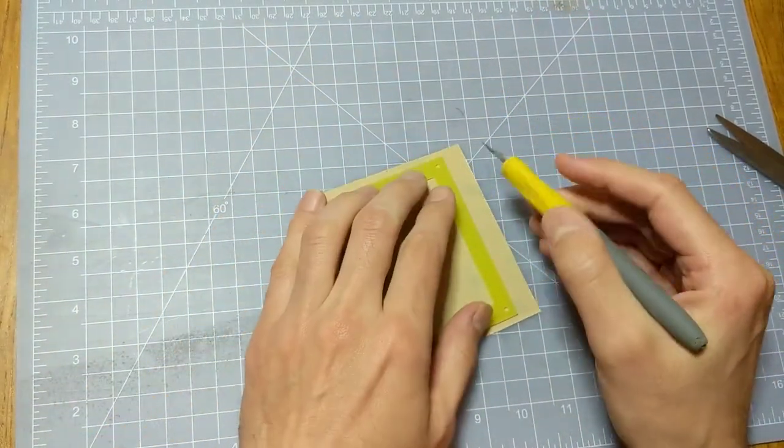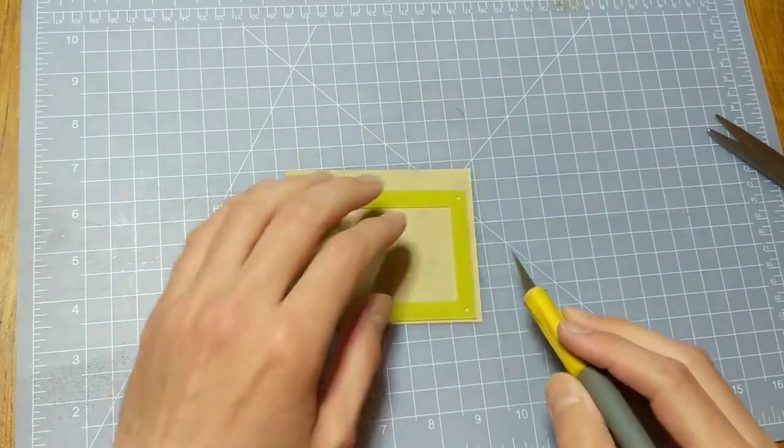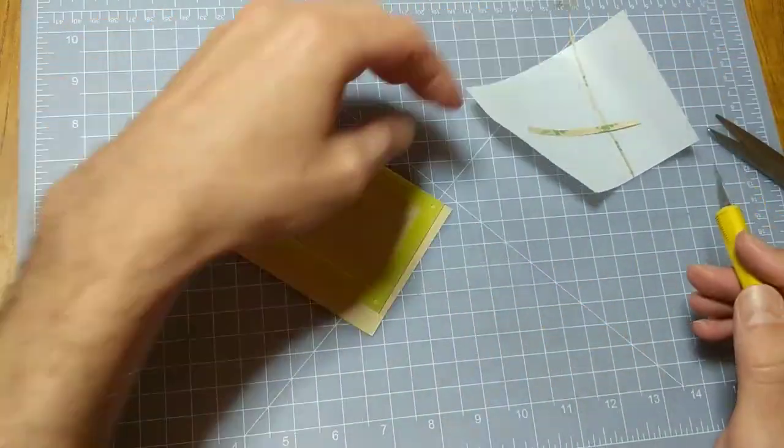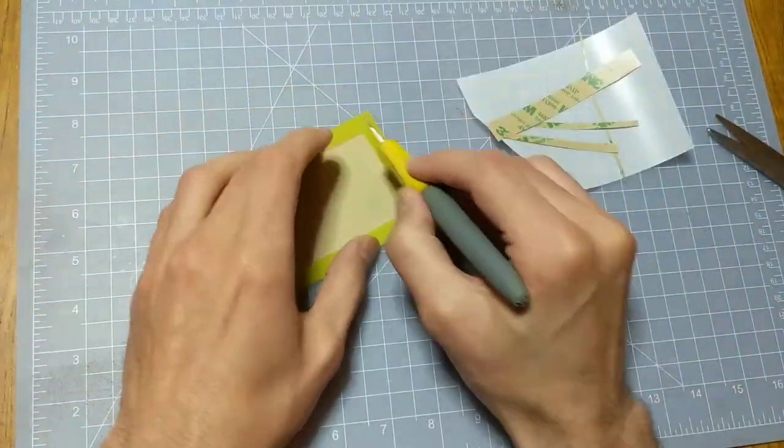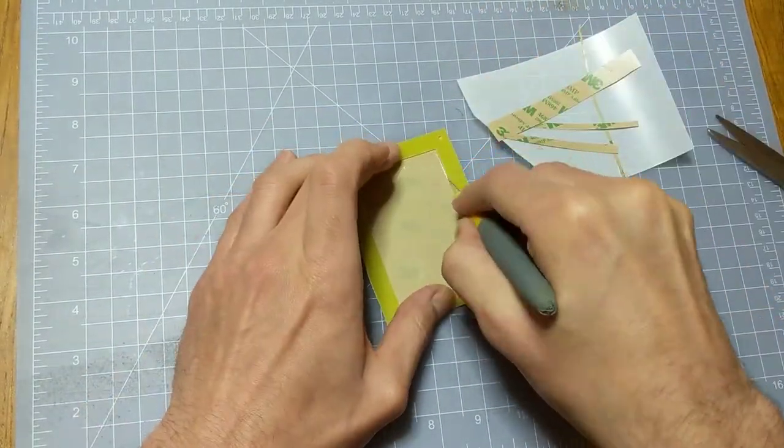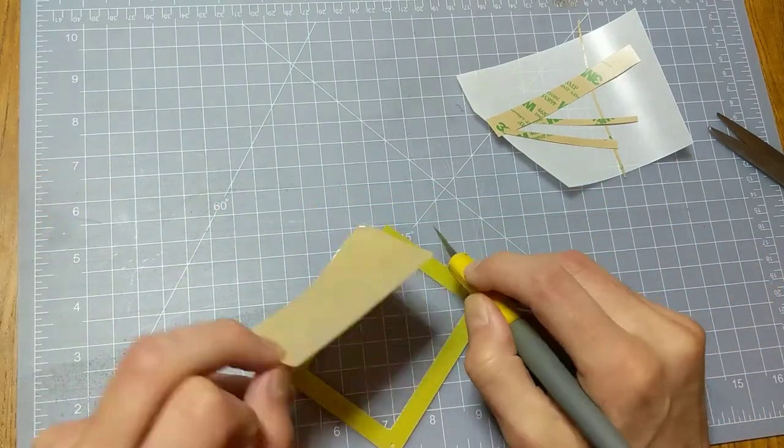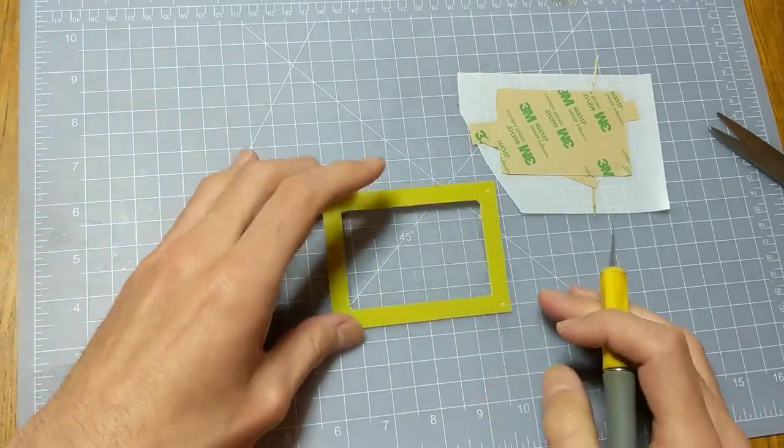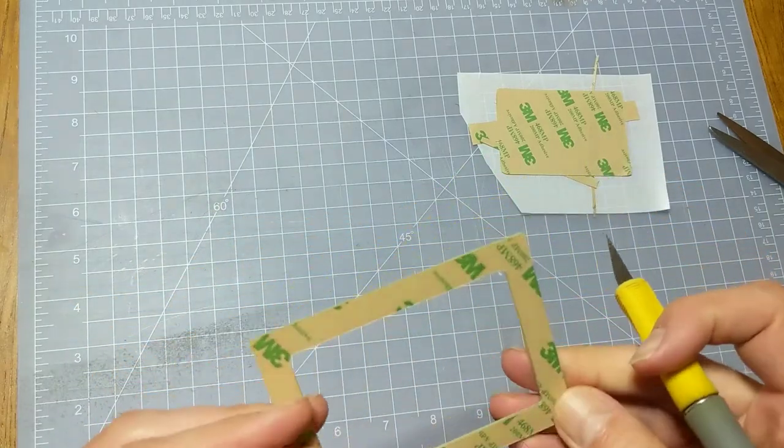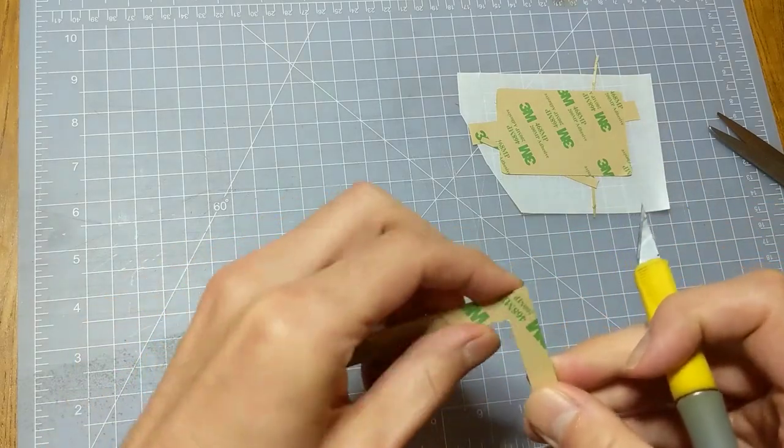Once that's pressed on tight, just cut off the excess adhesive from the frame. There may be a little bit of excess adhesive sticking out onto the edge. You can usually clean that off pretty easily by just rubbing it with a finger.